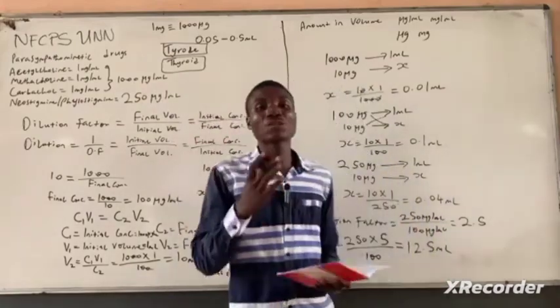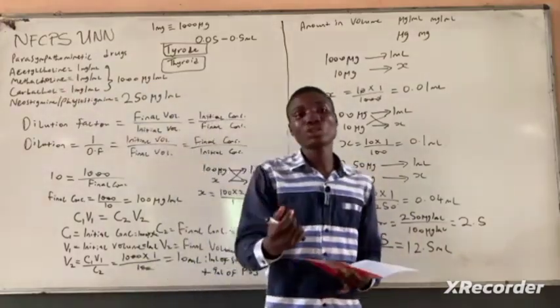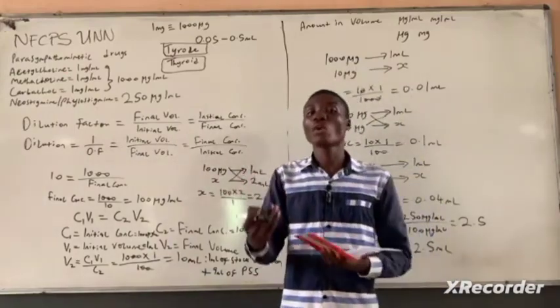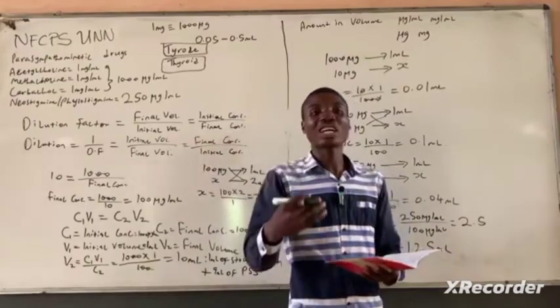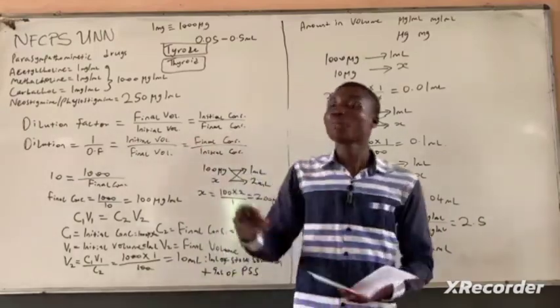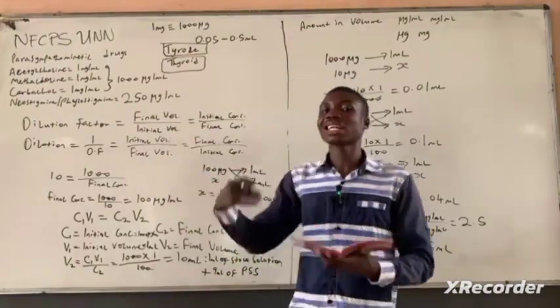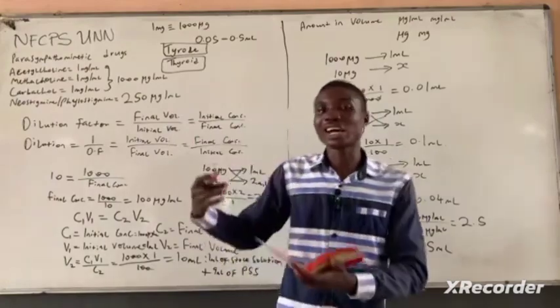Now your responses are supposed to be increased for acetylcholine. The reason is because the tissue has some elements of cholinesterase enzymes. So when you added the anticholinesterases, these particular agents, they actually work on the cholinesterase enzymes and decrease the rate of hydrolysis of acetylcholine that is applied to the tissue. Hence, it potentiates the action of acetylcholine.